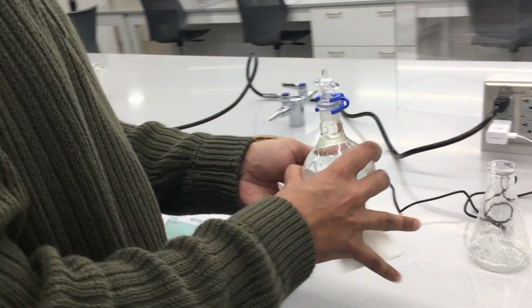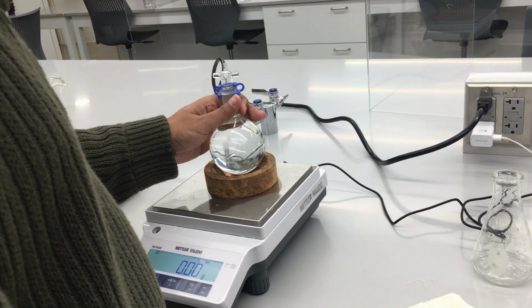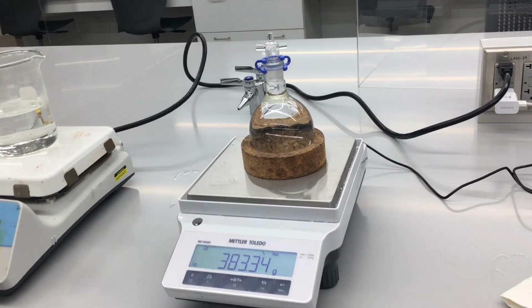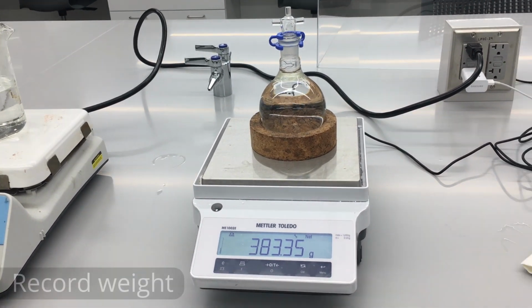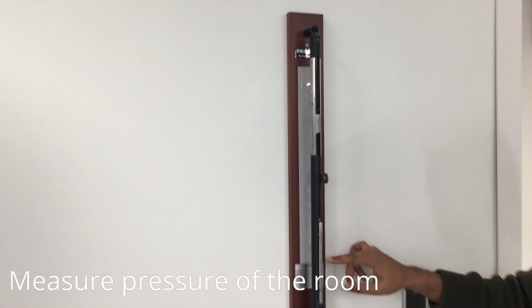All right, so I'm going to go ahead and clean off all the excess water and weigh that flask once again. So now, record that weight, it's about 383.35 grams. We take the difference between that and the empty flask, and then we know that is the mass of our water. Finally, we're going to go ahead and measure the pressure of the room.